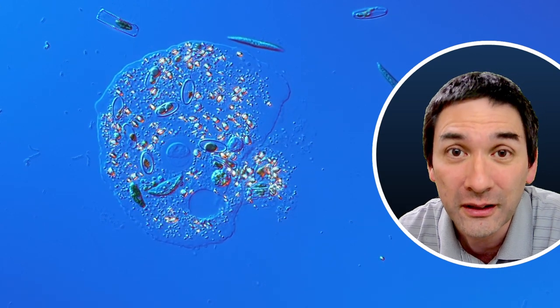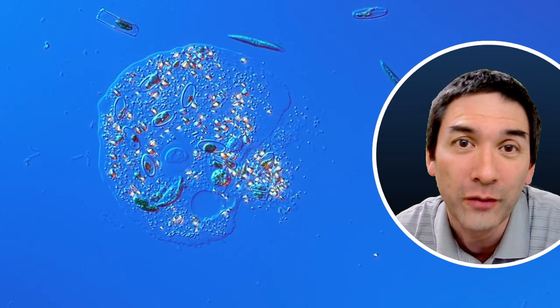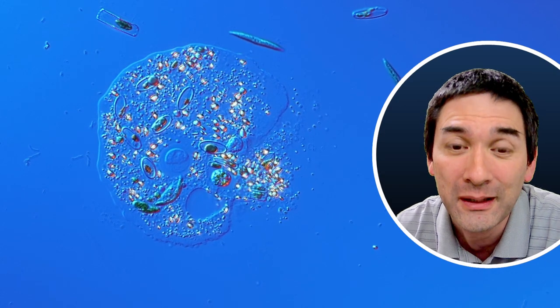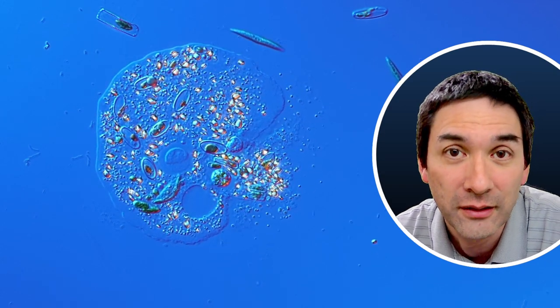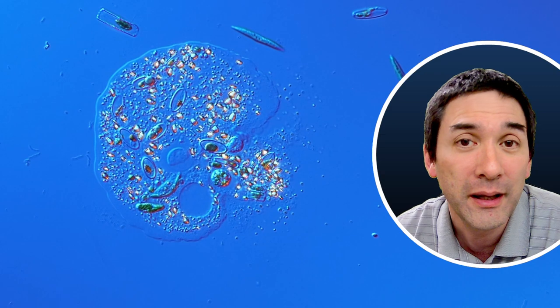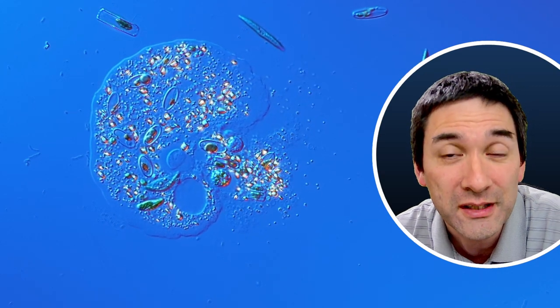Look, now it popped open and the contents of the cell are now spilled out. And that's it for the little cell here. And what's going to happen to all of those cell contents?